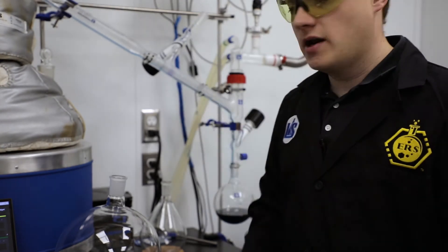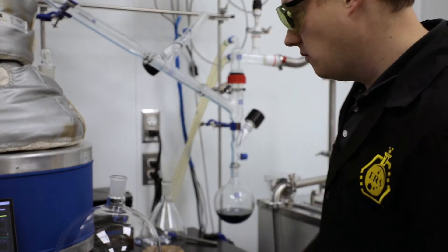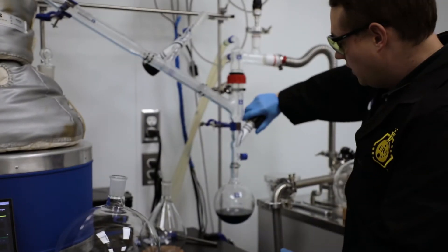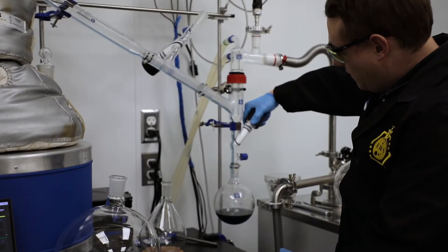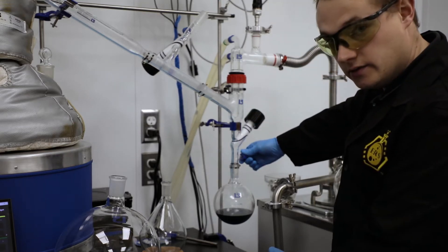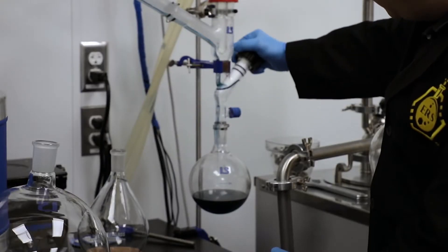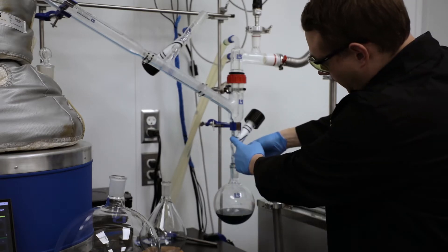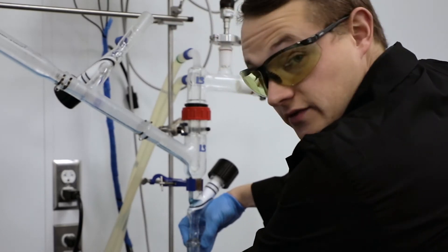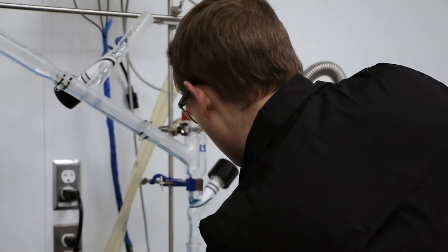I'm going to do a little flask swap just so I can get an accurate sample of that — not that I'd want to save this product by any means, but I want to get a nice little flash swap done. First thing I'm going to do is close off the valve, and then slowly release vacuum here. As you can see, we're getting a buildup of the liquid above. There's no bubbles coming through, which means I properly serviced this valve prior to the run — which is great.